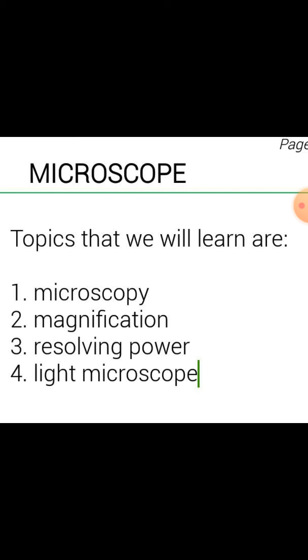Okay, optical instrument. The word optical instrument refers to a light instrument, in which light is used. Optical means light. The physics in an optical instrument is the use of light. The resolution of a human eye, our eye resolution, is 0.1 mm.